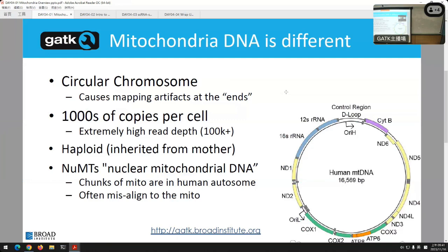But the problem is mitochondria are weird in yet another way. You've got a new source of contamination purely when doing mitochondrial DNA, called NUMTs. Basically, over evolutionary timescales, little bits of mitochondrial DNA have been absorbed into your nuclear DNA. They're in your autosome now. And it's a problem because there are a lot of them all over, and the amount varies. Some are maybe 1,000 bases. You've got some places where you've got upward of 16,000 bases. The entirety of it is just sucked in there.